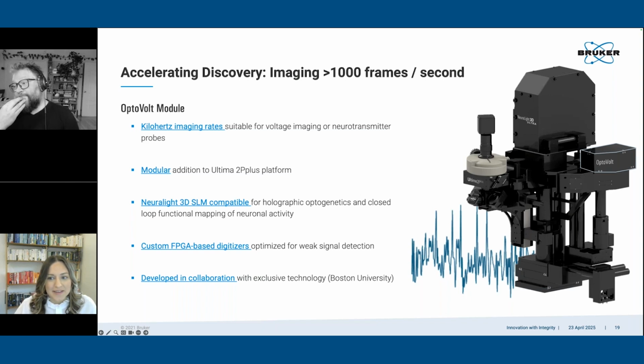Absolutely, definitely a future question. But 15, 20 years ago, the things you're talking about here, using a voltage indicator with 3D patterned optogenetics, would have seemed probably as far-fetched as the question asked here about miniaturized super resolution two-photon. So I'm really glad people were asking.